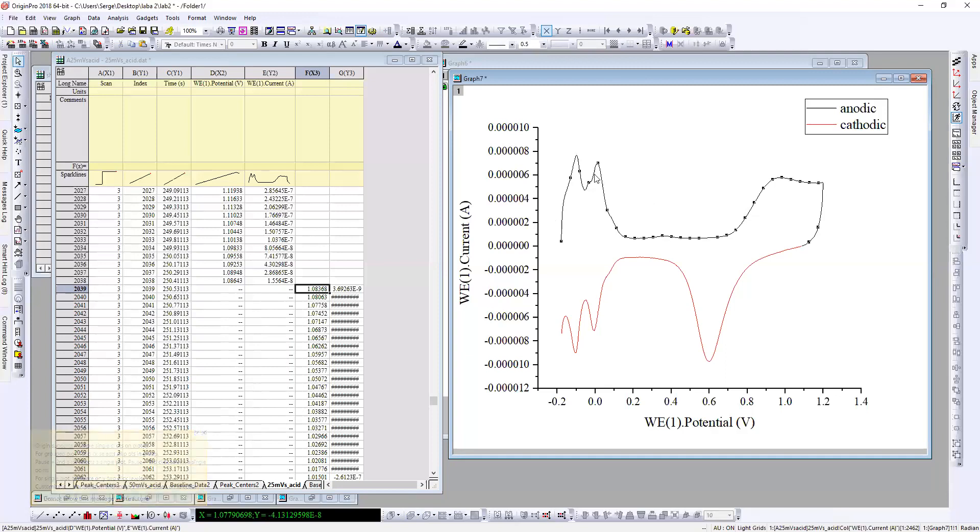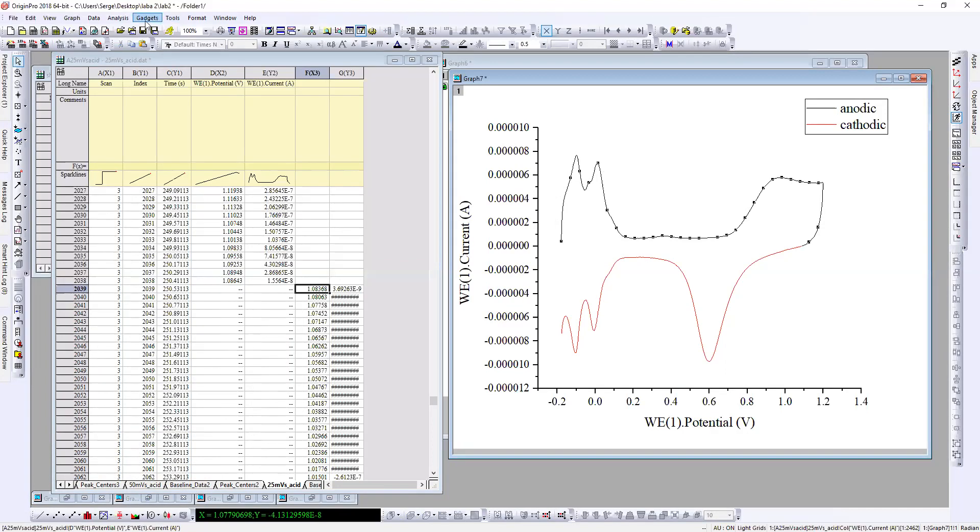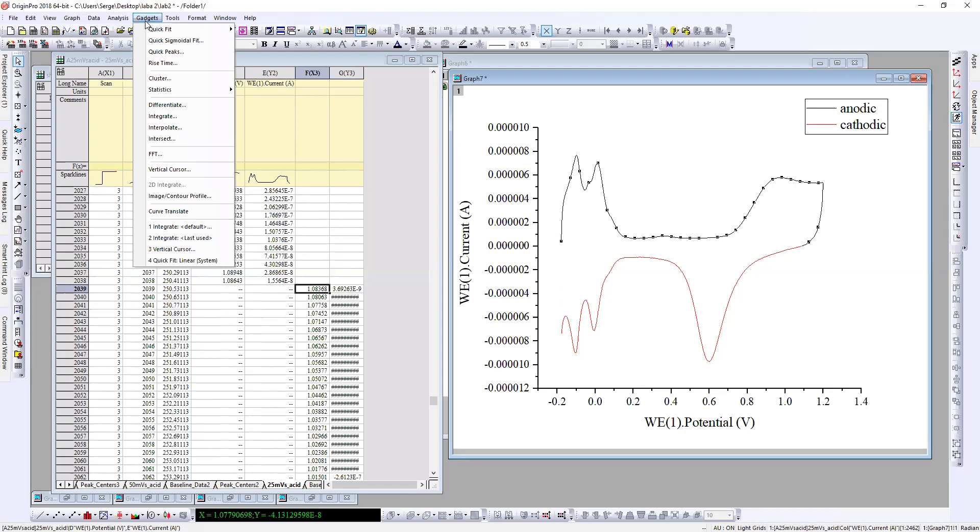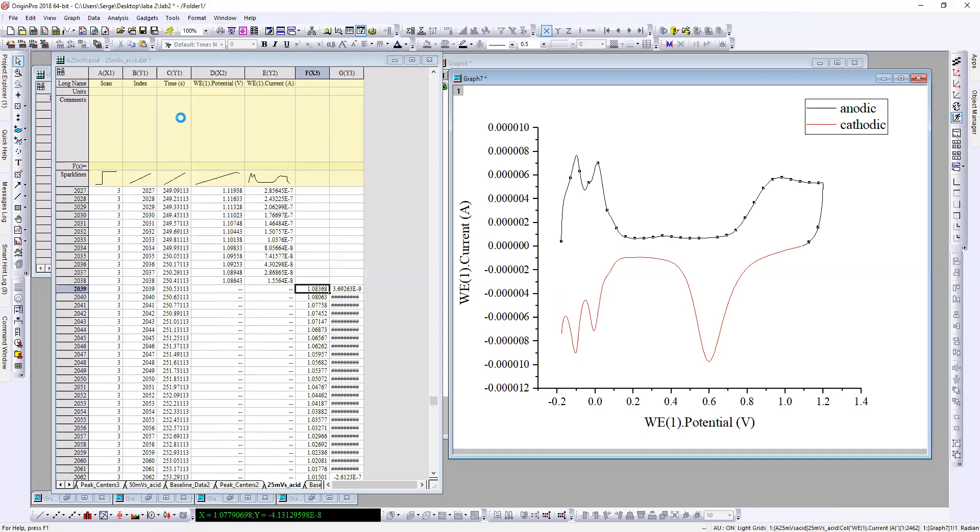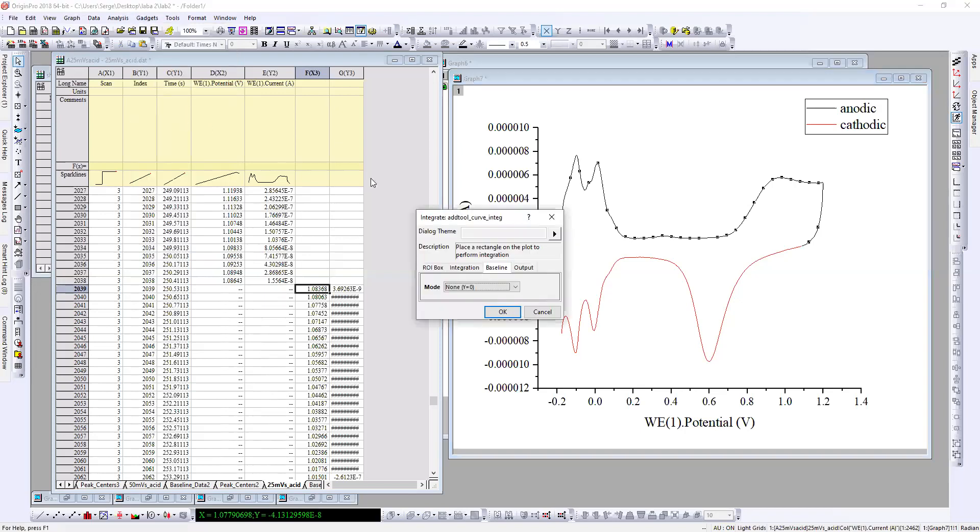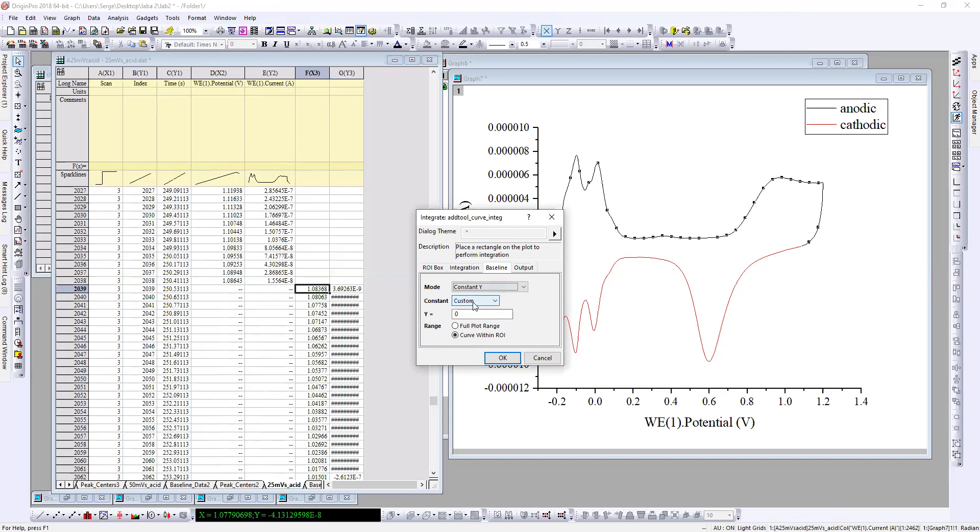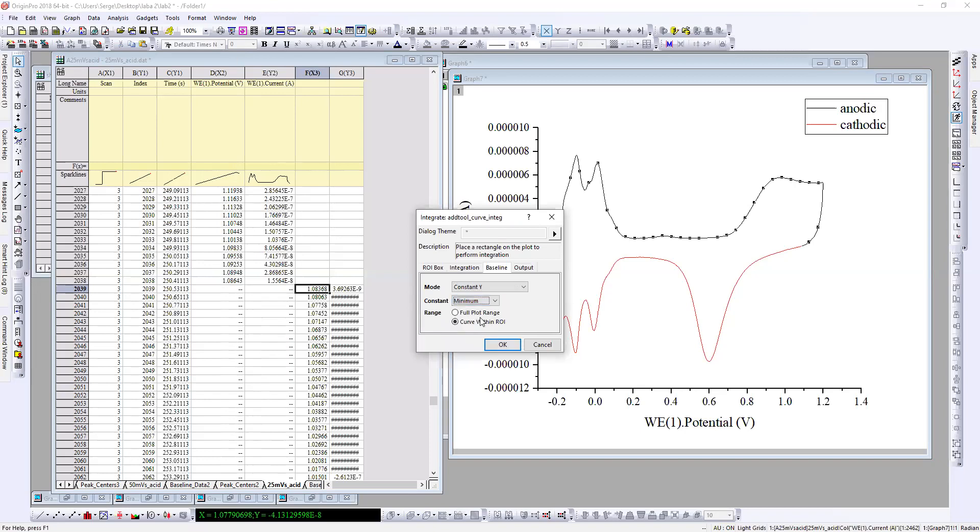For example, I would like to integrate this area, so I click on the black curve, then move to gadget integrate. I will choose the baseline constant, link, then minimum.